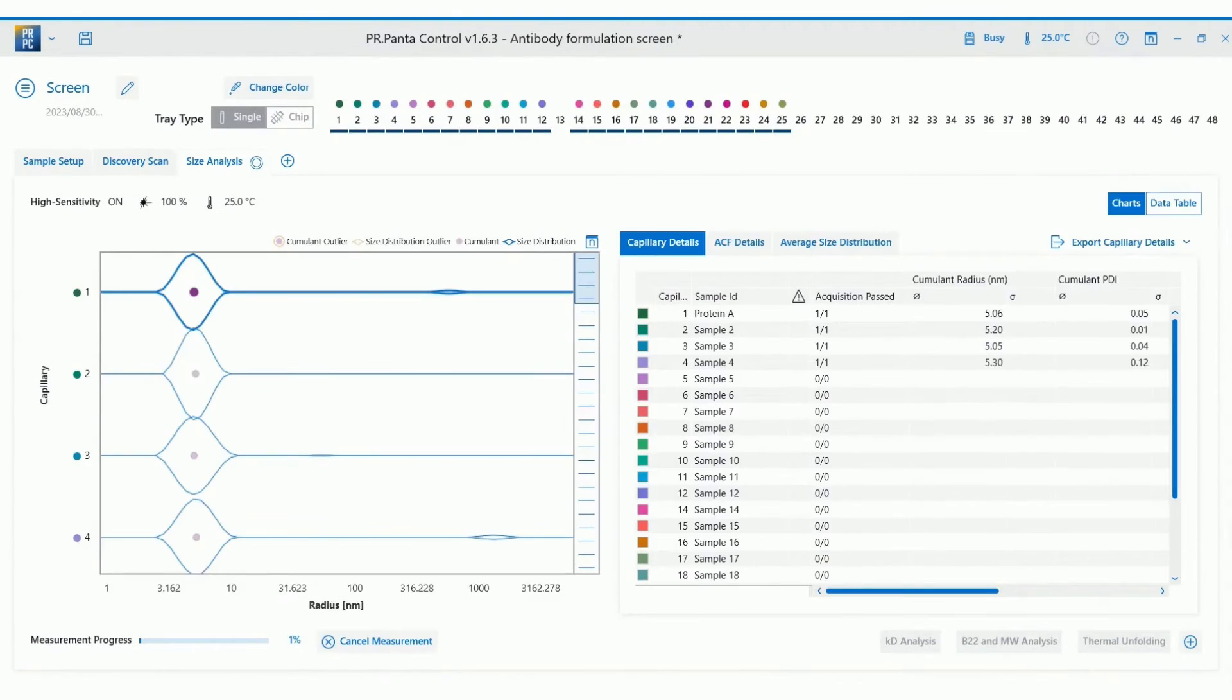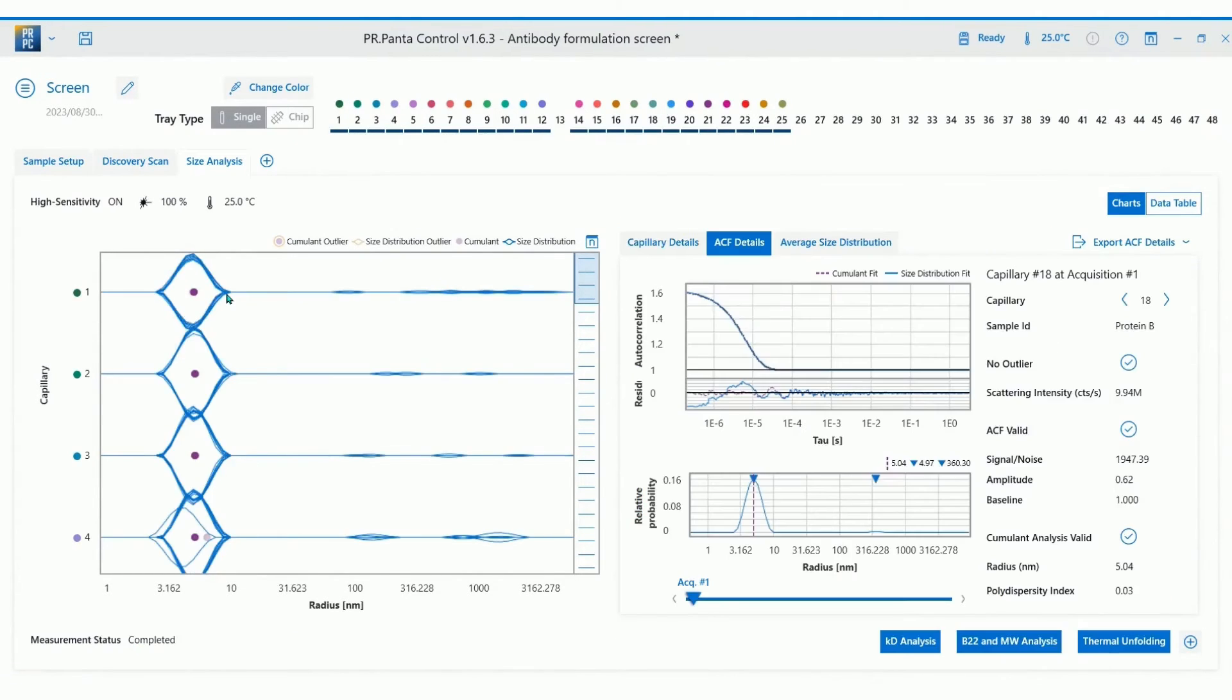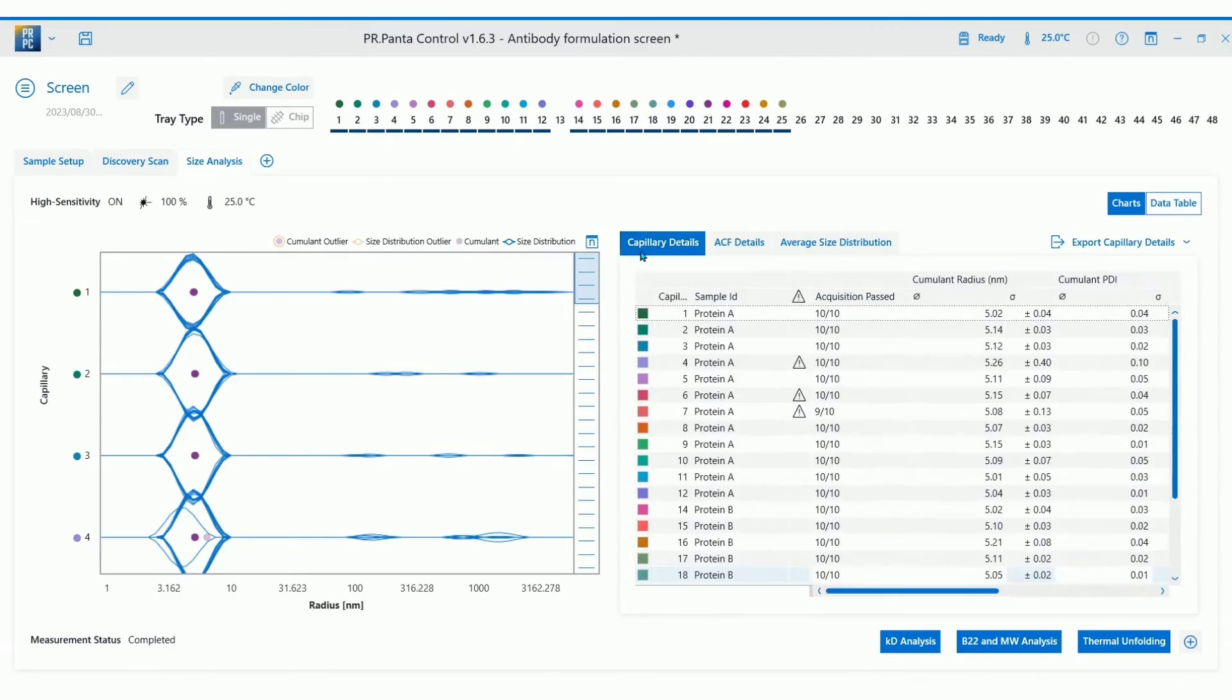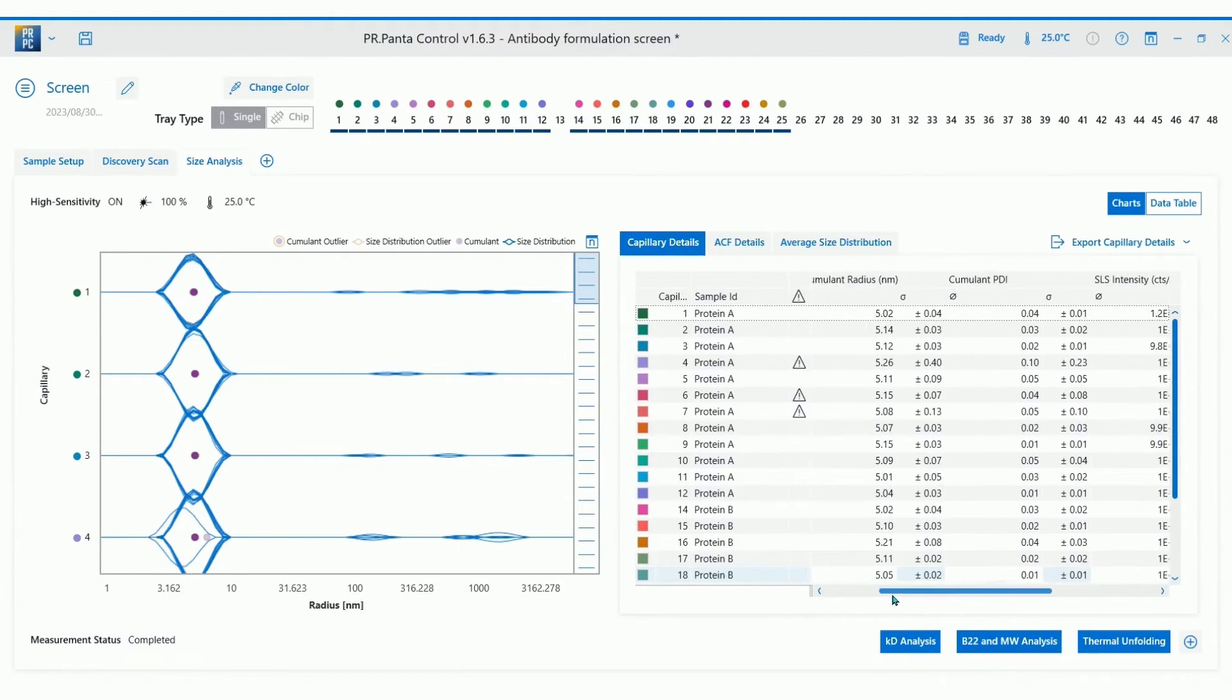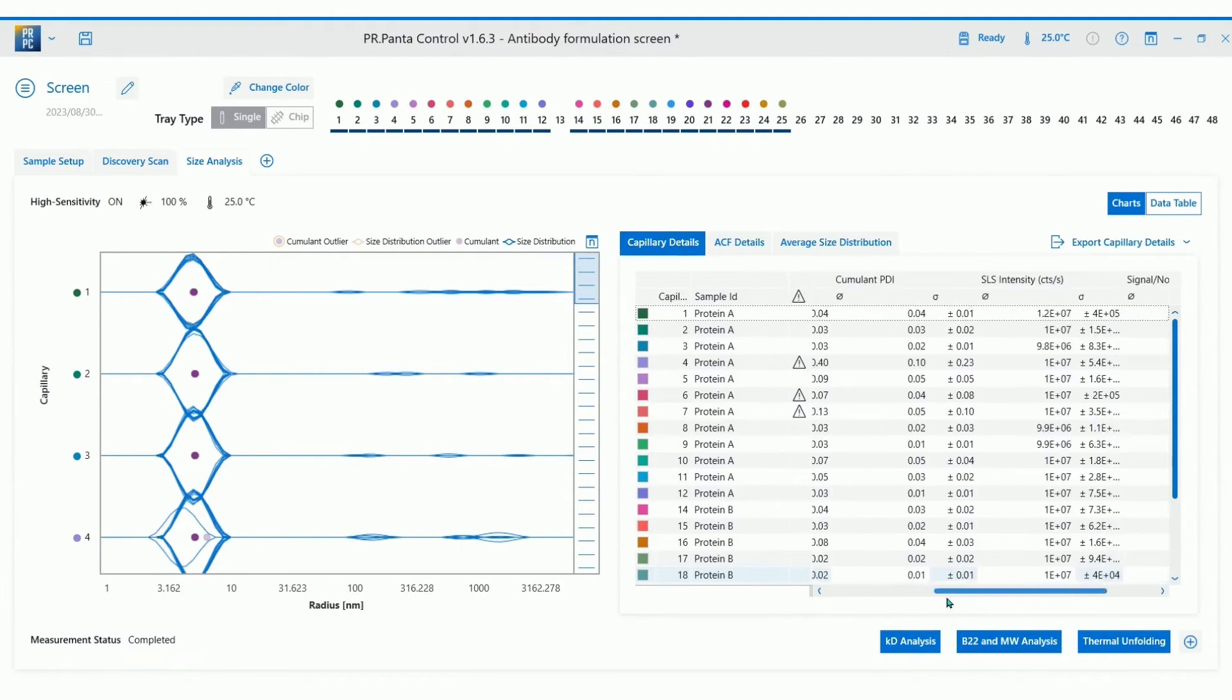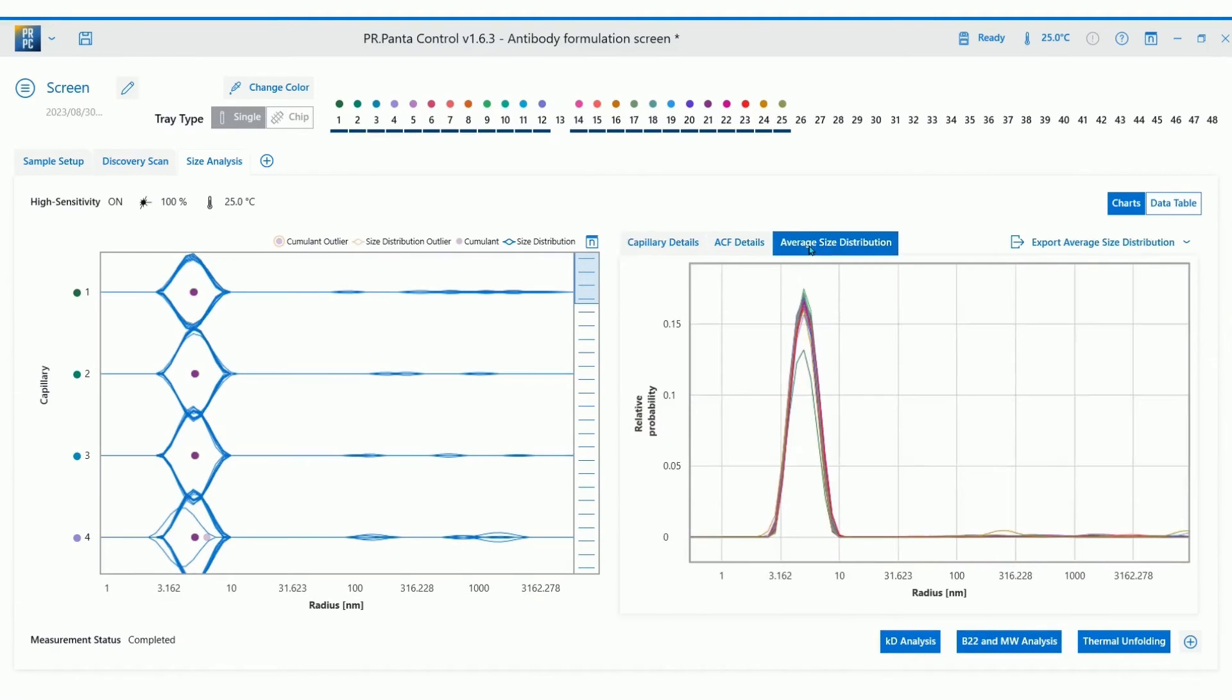The data will populate in real time during your experiment. So you can always pop in and check how things are going. Once it's complete, you will see a visual readout of the results in the form of a violin plot displaying the size distribution. Additional parameters such as the hydrodynamic radius, the polydispersity index and the size distribution are displayed in a table for review.